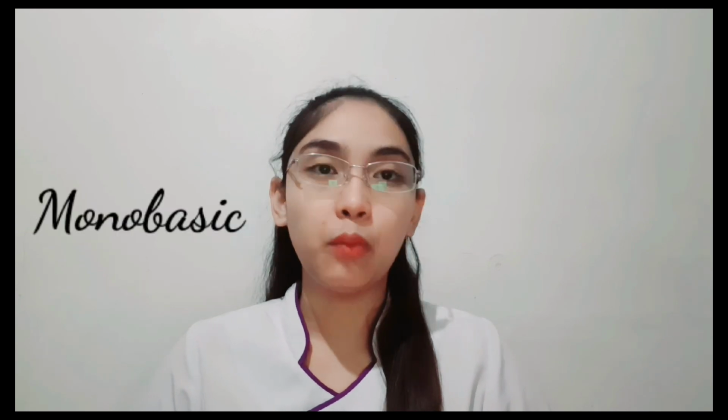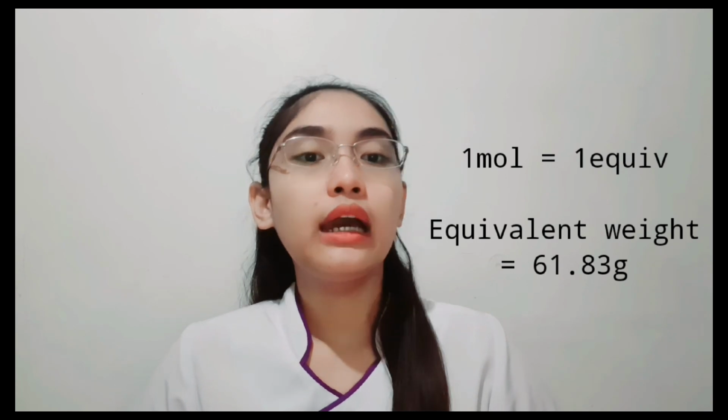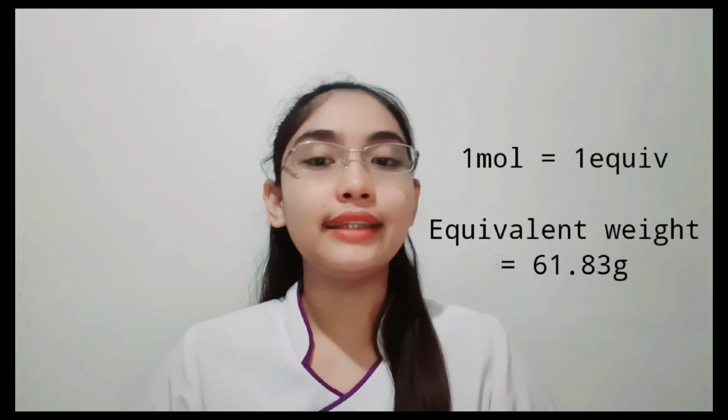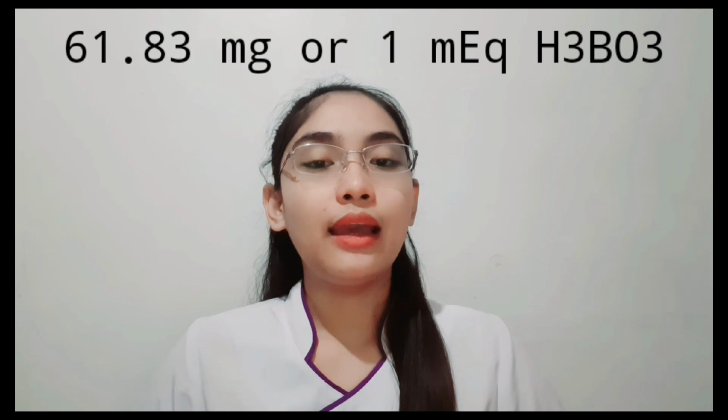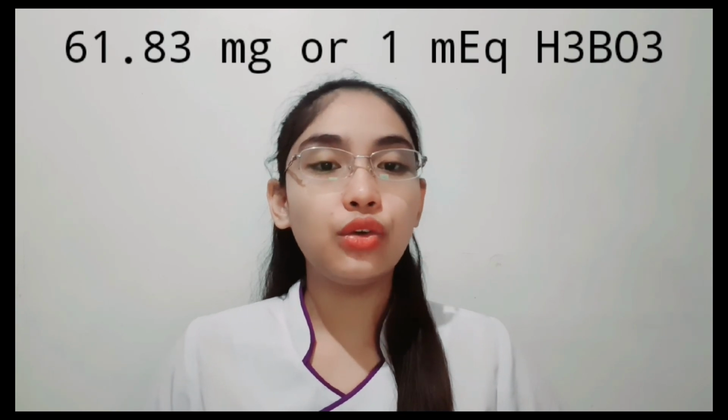In this titration, H3BO3 or boric acid behaves as a monobasic acid. 1 mole is equivalent to 1 equivalent, and the equivalent weight is 61.83 grams. Each milliliter of 1N sodium hydroxide is equivalent to 61.83 mg or 1 mEq of boric acid.